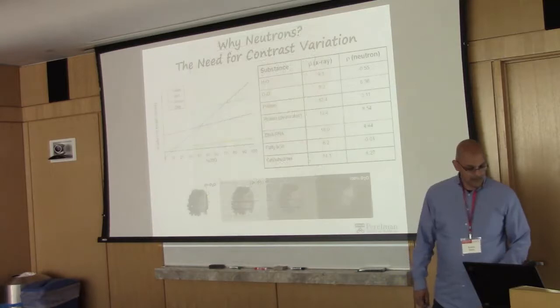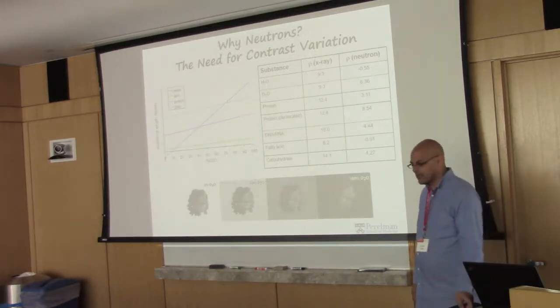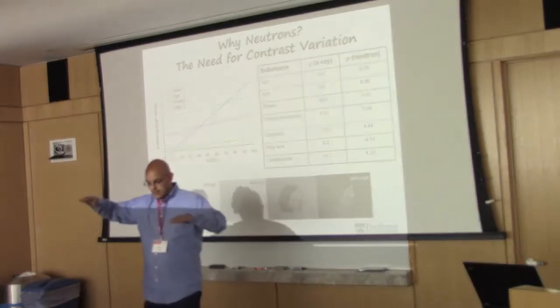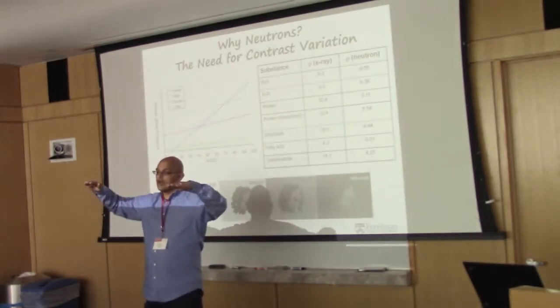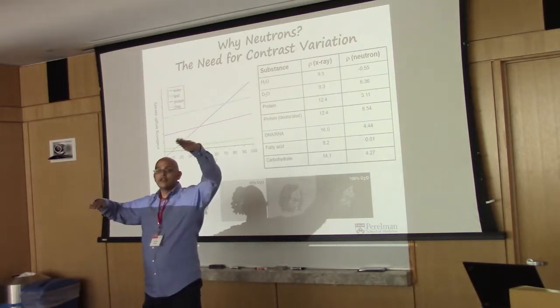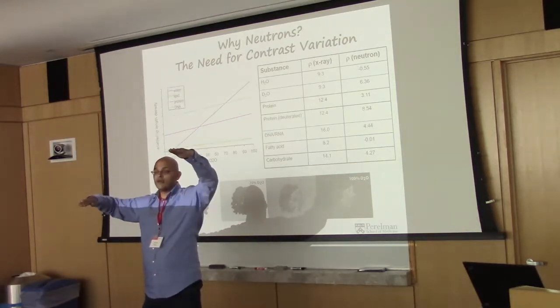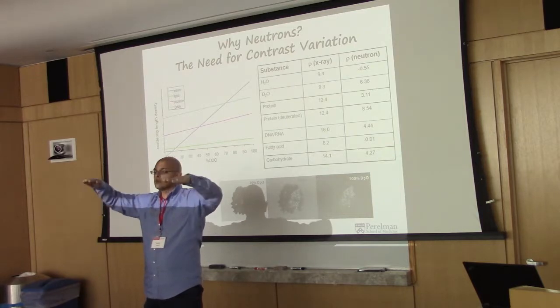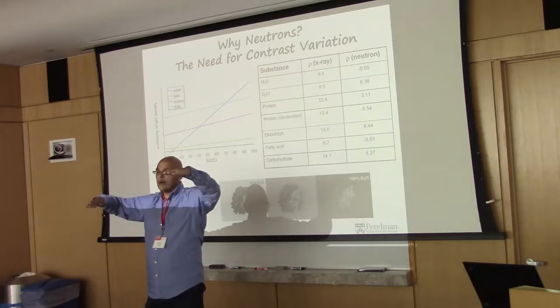What you're doing here, in general terms, is changing the scattering power of one component relative to the other. It's really the net. When you do a scattering experiment, you're subtracting the solute buffer and subtracting away buffer to get the net scattering of your solute. In the same way, you can change the relative difference in scattering power between A and B. It basically changes what the net observation is.